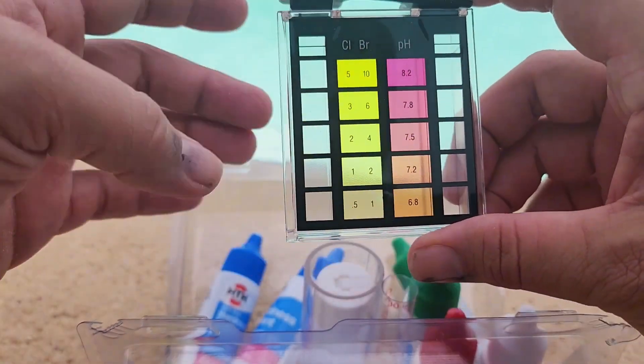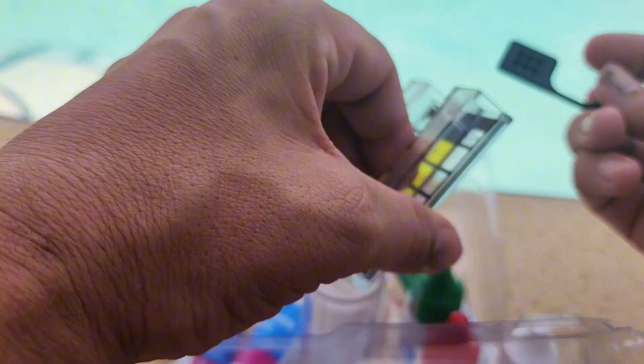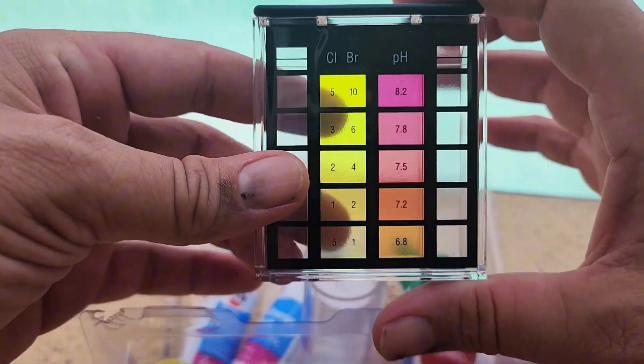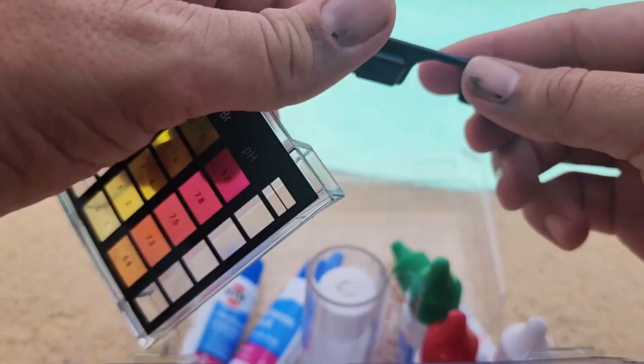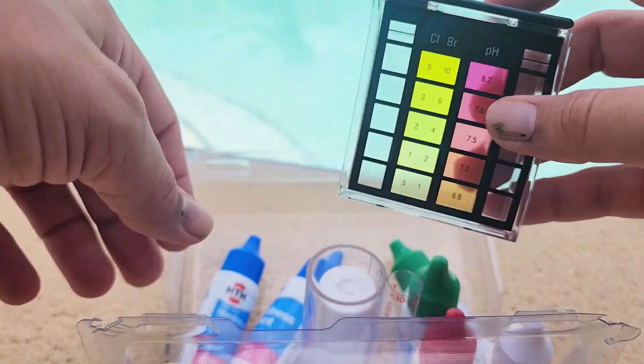One of the main things that comes in this kit is the viewing glass, and I love this style of viewing glass. I've bought a bunch of different test kits, and honestly this is the nicest viewing glass out of all of them. I love this little rubber topper — it's super easy to get on and off.